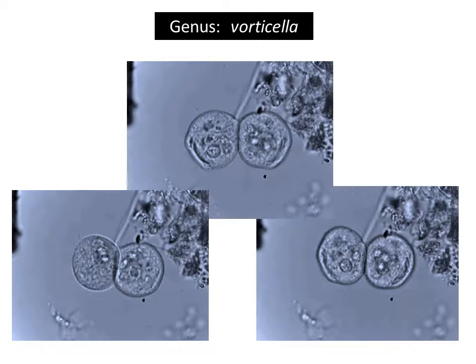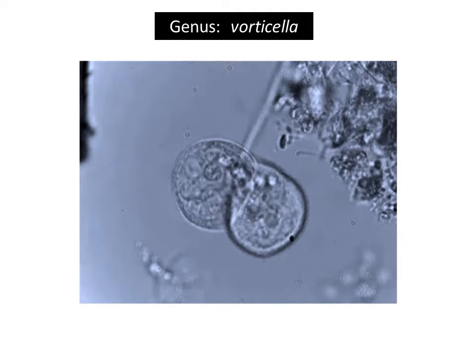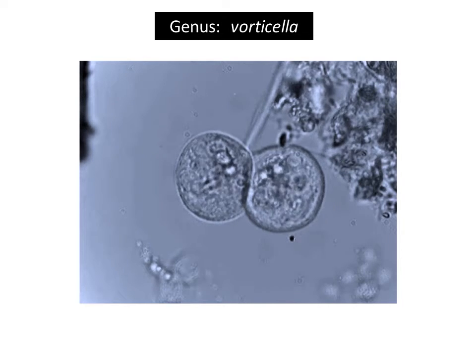It should be noted that the parent cell is identified by its direct attachment to the apex of its stalk via its collar, whereas the daughter cell is attached laterally as an extension of the side of the parent's collar. Nonetheless, the parent cell and the daughter cell are otherwise approximately the same in size and shape. The outcome is the formation of side-by-side cells connected basally to a common stalk.